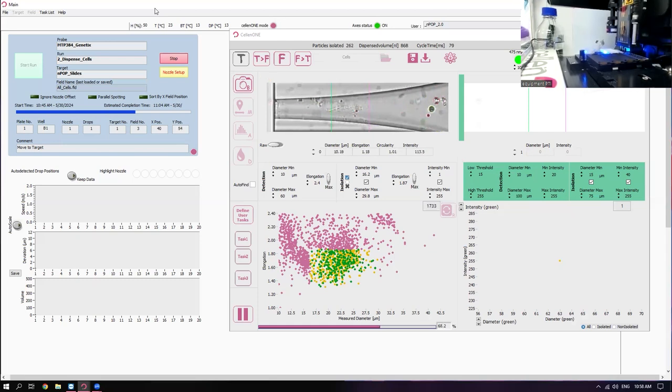So, the next day. Ryan Kelly, they did one last year where they had a poster for single bacteria proteomics. I think they were getting a few hundred proteins per cell, per bacteria. And then there are a number of other groups who are doing similar things that haven't shared yet.